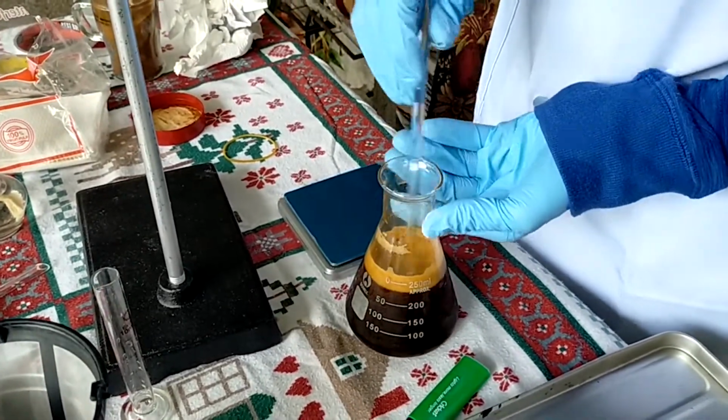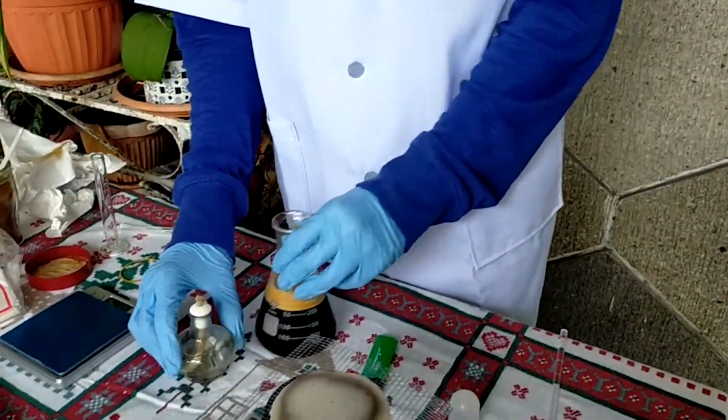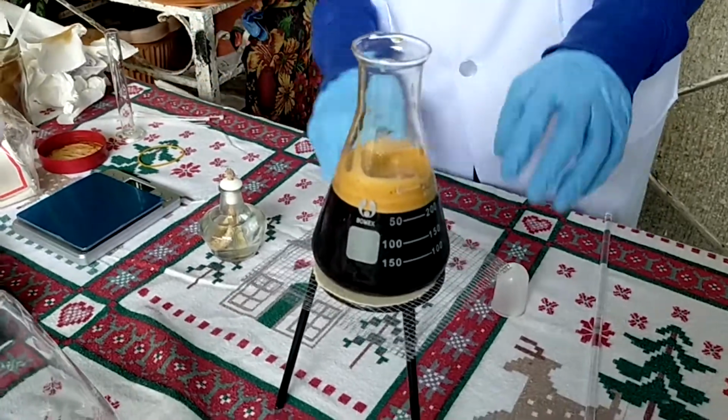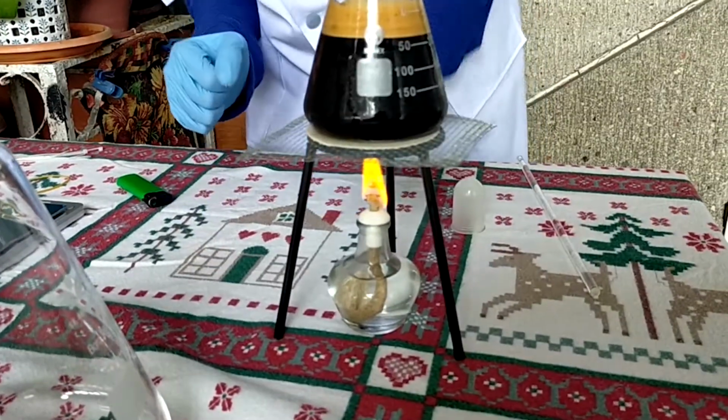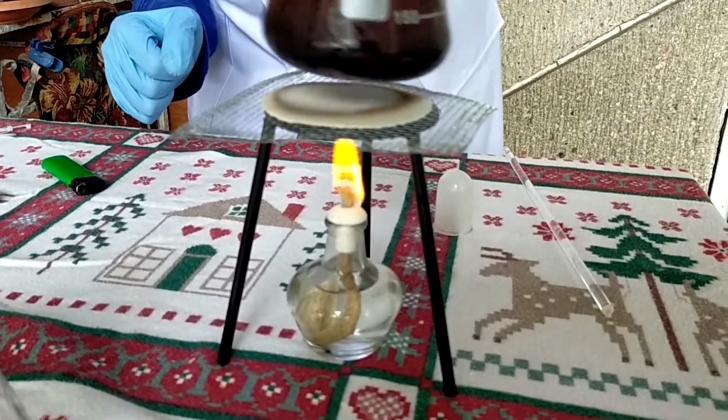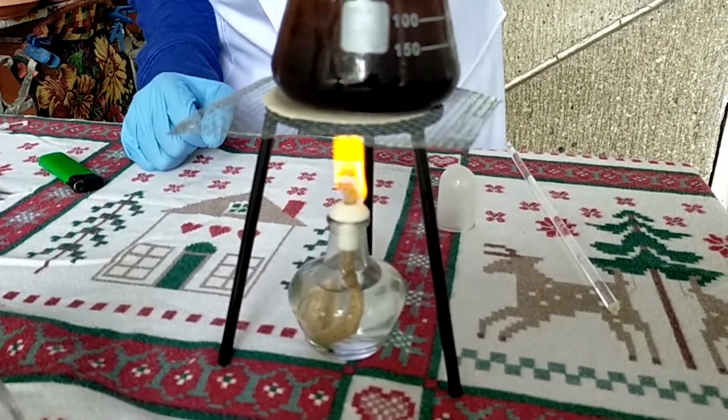like 50 ml of this. Now I will be heating the coffee, sodium bicarbonate, and water mixture. I have it here very fast. Put it there. Of course, I will slosh this occasionally so that the heat will be evenly distributed.